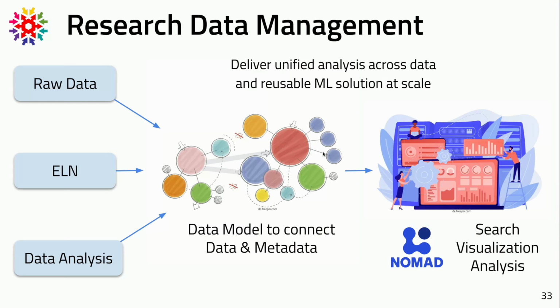So after defining our data model, we can go on and think to develop tools within a platform, in our case NOMAD, and these tools are benefiting or exploiting the structure we defined, and they can enhance searching features or visualization or even automated post-processing or analysis features.